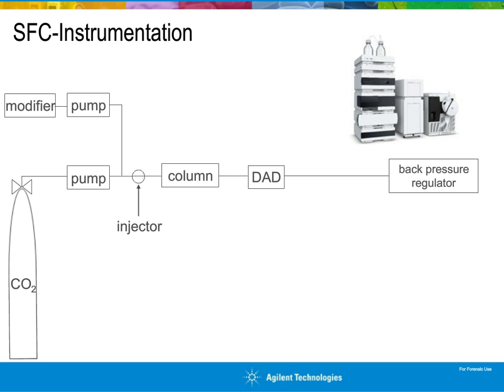could also be a separate pump, is a modifier, and the modifier can be any solvent combined with water or buffer, anything that suits the analytes you are looking at. And if we move along, then we can connect this as well to a mass spectrometer.